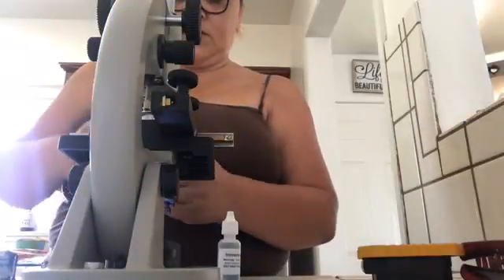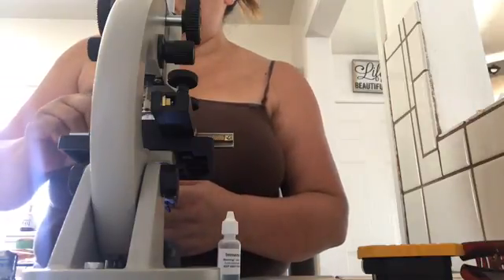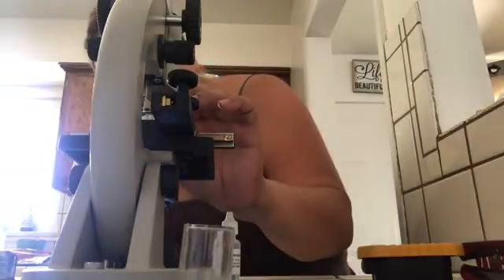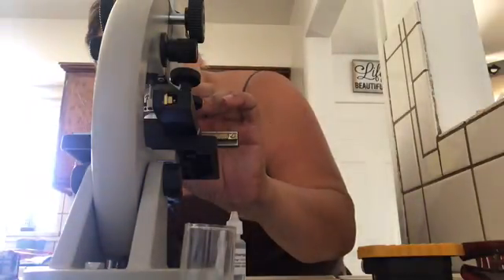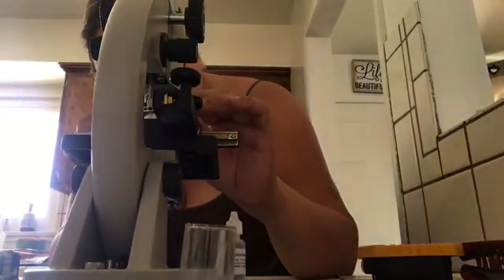So we did the scanning power, the low power, the high power. I'm having kind of a hard time, so I'm going to skip over that for now so I don't waste any more time, and I'm going to do the oil immersion lens. So I'm installing that right now. Also, this microscope, it's a good microscope, but it doesn't have the best lighting, and it's a little hard. It's giving me a hard time.